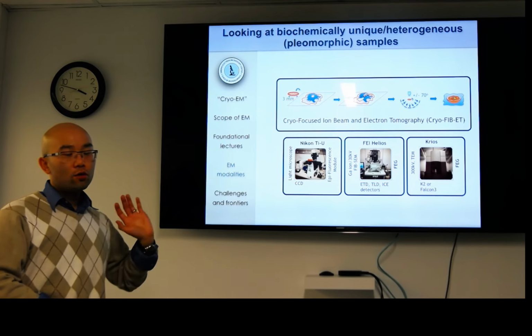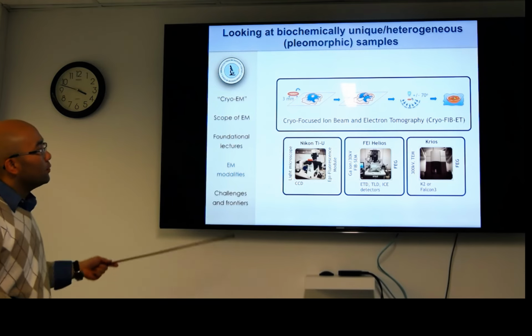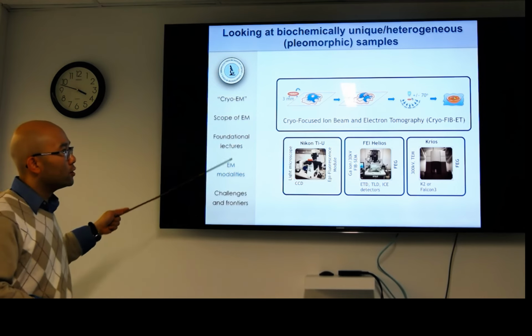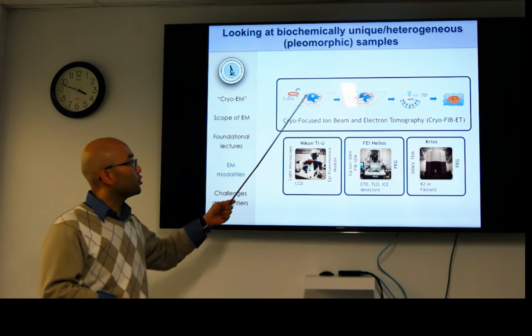As I said, this course is trying to move forward and introduce new topics to you within these different modalities. Something that we are really working on in the center, and that the field is moving towards, is in vivo or in situ types of electron microscopy, and especially correlative microscopy.